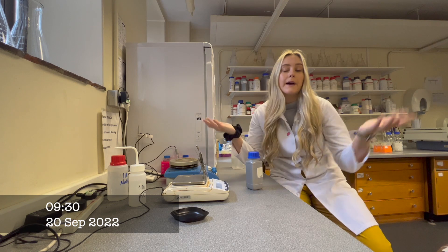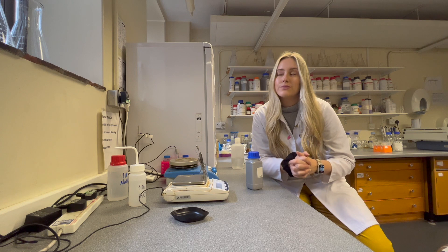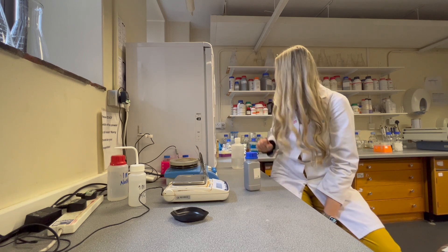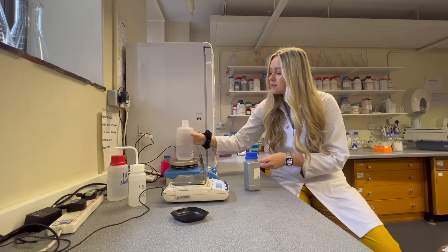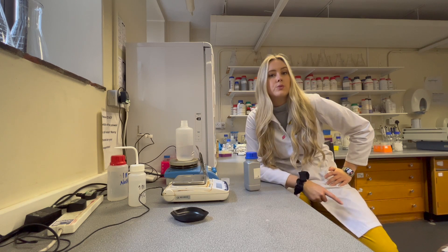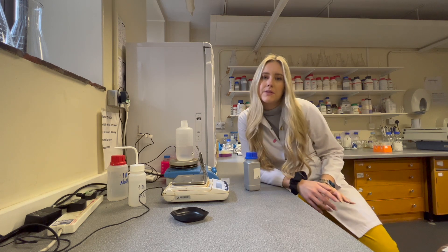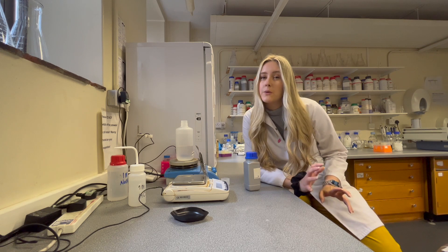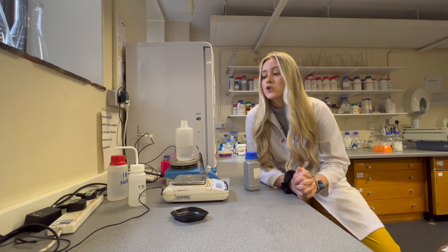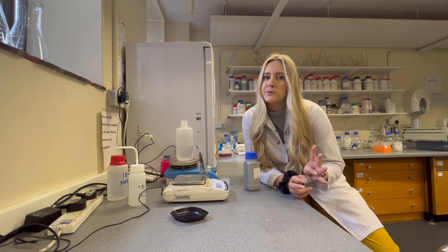Hello, welcome back to the weekly lab vlogs. Today we're doing something we haven't done in a very long time — I'm going to prepare some media. It's actually Tuesday and I need to run some bioassays because I've been writing up over the last two weeks. I've been very sick, and as I've been writing my thesis I've found some gaps with experiments — things I need to fill in for chapters two and four.